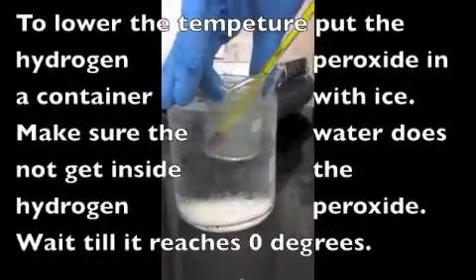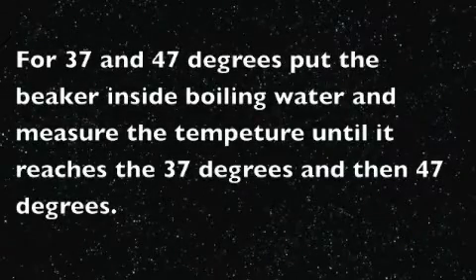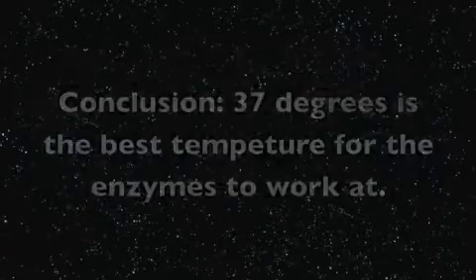For 0 degrees, put the hydrogen peroxide in a container with ice. For room temperature, just leave the hydrogen peroxide alone. For 37 and 47 degrees, put the beaker inside boiling water and measure it.